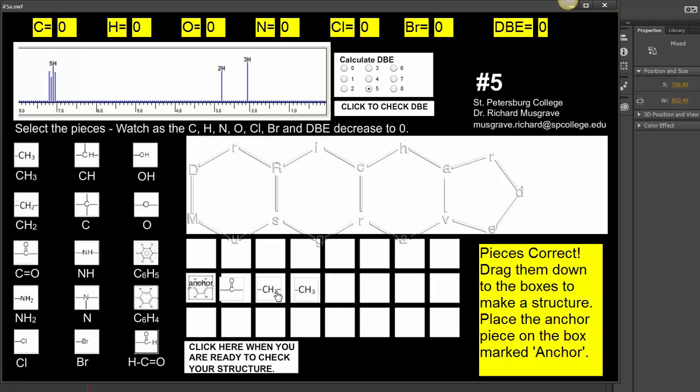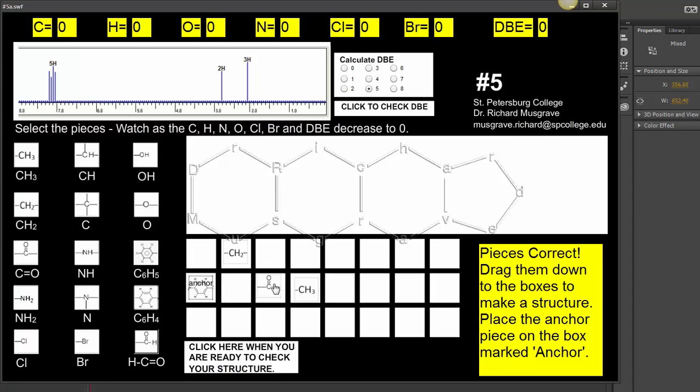The CH2 would couple to the CH3 and have four peaks. CH3 would couple to the CH2 and have three peaks. As you can see, these are single peaks, which means they don't see each other. So there's only one way that they could possibly be, and that's like this.